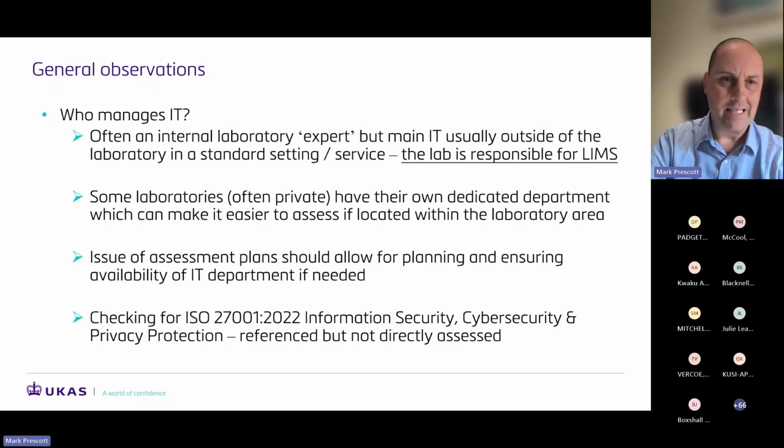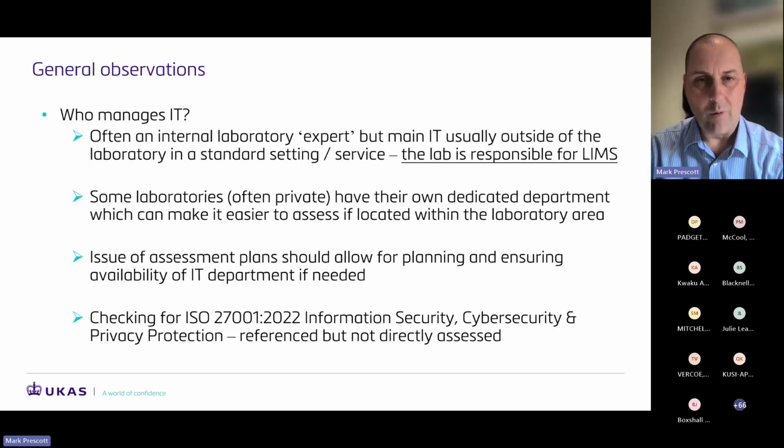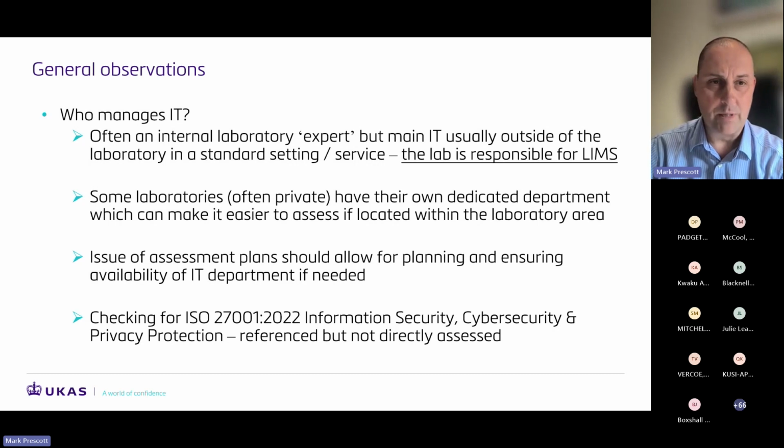Very often the main IT department is outside of the laboratory in these standard settings. It's worth bearing in mind that there is a clear statement in 2022 that it does say that the laboratory is responsible for its own LIMS. So even where there is an external IT department who may have responsibility for managing this, it is the laboratory's responsibility. We cannot just say it's nothing to do with us, it's the IT department who sort that out.